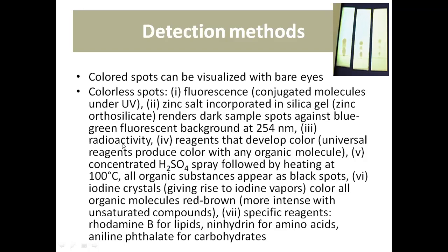तिसरा जो प्रकार आहे, we can use a radioactive material to label the sample components. Okay, and then by using certain methods like autoradiography, जे आपण नंतर बघणार आहे इलेक्ट्रोफोरेसिस मध्ये. Okay, so by using autoradiography we can see the sample spots on the plate. किंवा एक साधी गोष्ट सांगायची म्हणजे एक फोटोग्राफिक फिल्म असते किंवा एक्सरे फिल्म असते, ती फिल्म जर आपण याच्यावरती ठेवली आपल्या प्लेटवरती, TLC प्लेटवर, तर काय होतं, रेडिओ ऍक्टिव्ह मटेरियल जिथे आहे आपलं, कारण आपण रेडिओ लेबल केलेलं आपल्या सॅम्पलला.